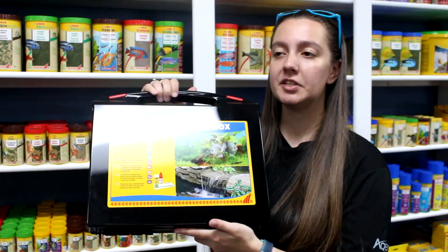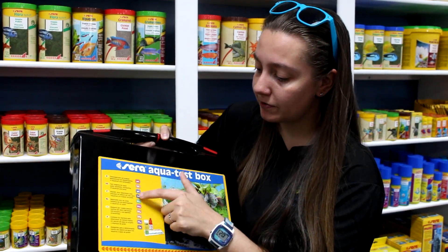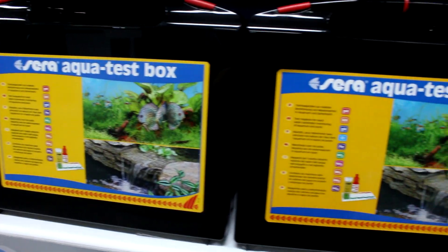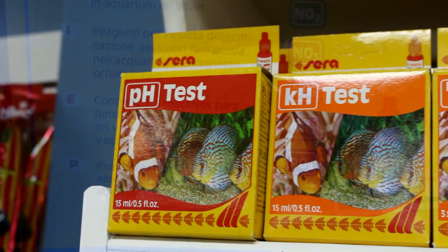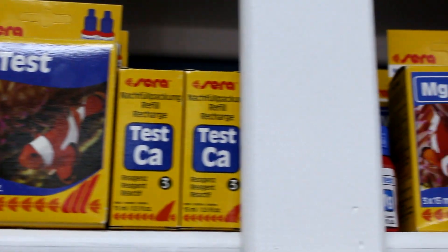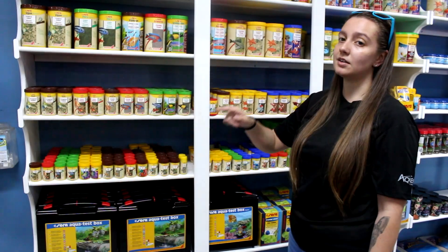This is our Sera test kit — we really highly recommend that you purchase one of these. It comes with ten different things that you can test in your water. This kit is going to last you at least a year, so it's definitely a great investment. We also sell the tests individually, but it's a better bang for your buck if you get the kit. All the instructions are right on the bottles, which I'll show you once we head to the back.